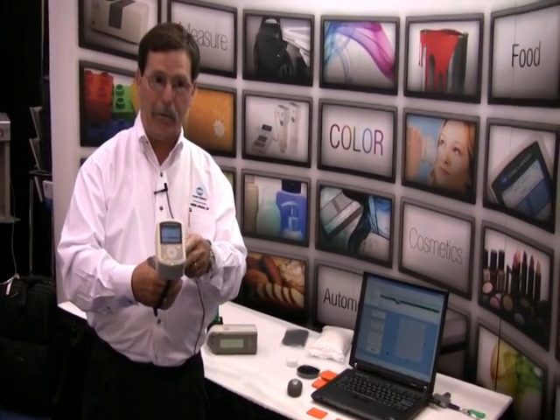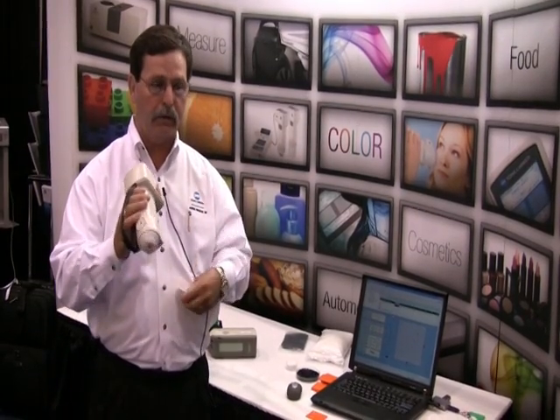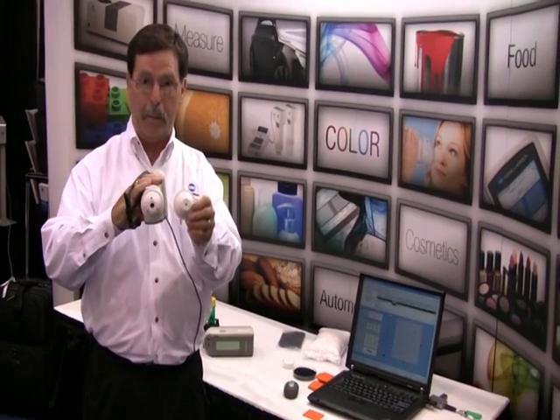We just had a short demonstration of the CM700D. This is the first portable spectrometer with a color display, and the first portable spectrometer with Bluetooth technology. Depending on the adapter that we assign to it, we can communicate up to 100 meters away. The instrument also comes with two different apertures: an 8mm and a 3mm aperture.